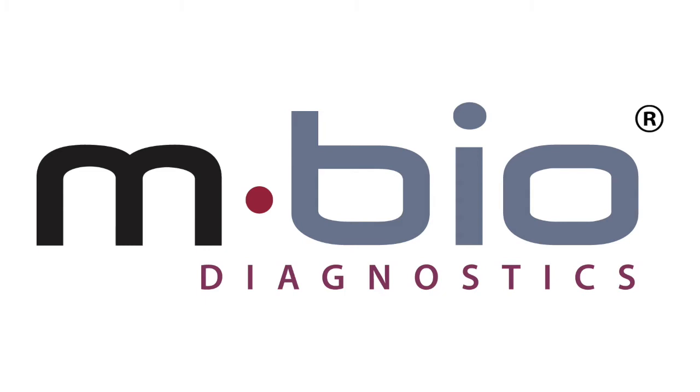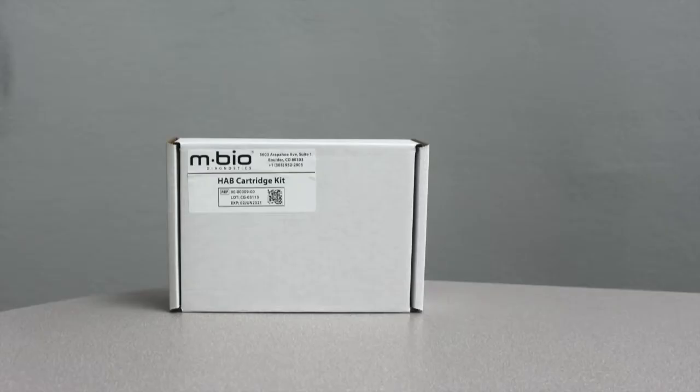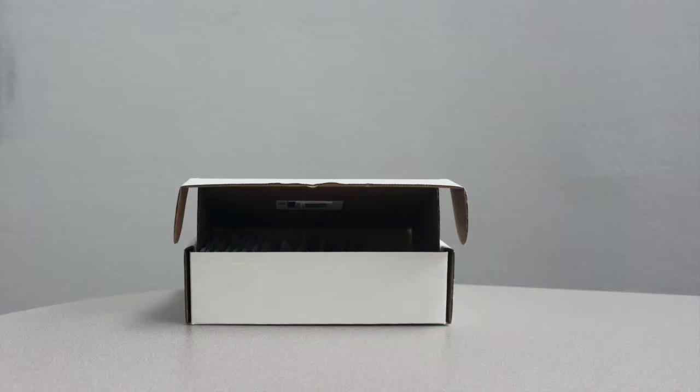Hello, today we will be talking about MBio Diagnostics MQ instrument and how to properly prepare and run samples for HAB toxins. Before beginning the procedure, ensure that you have the following components.